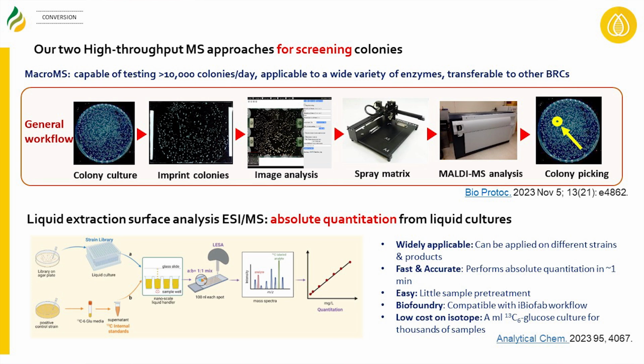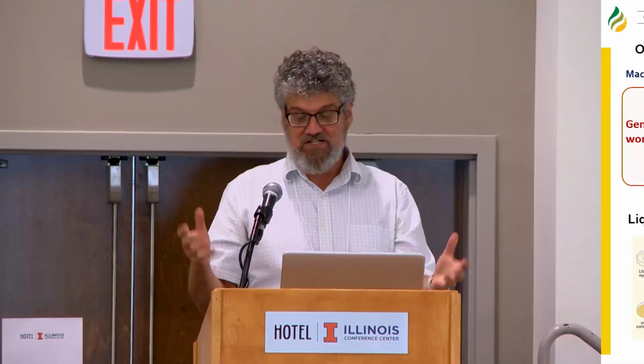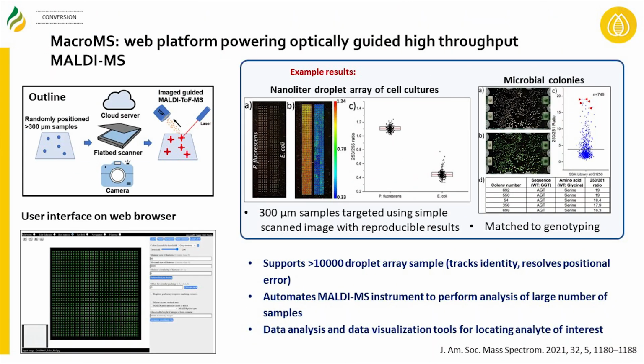It's about a minute a sample. So just a slide on both, but it's just sort of showing you how this works. I won't use the pointers, you don't really need it. But the idea then is you have an array. It could be randomly organized spots. It can be a microarray.